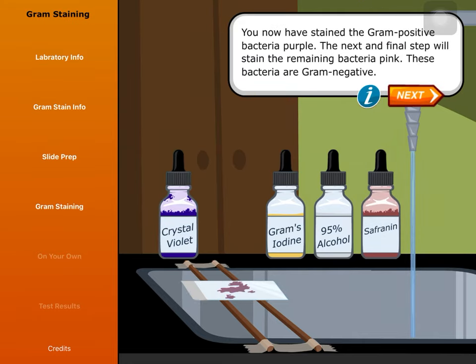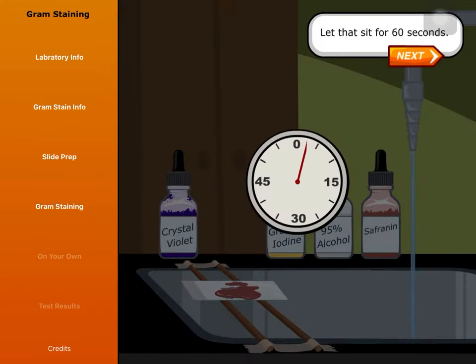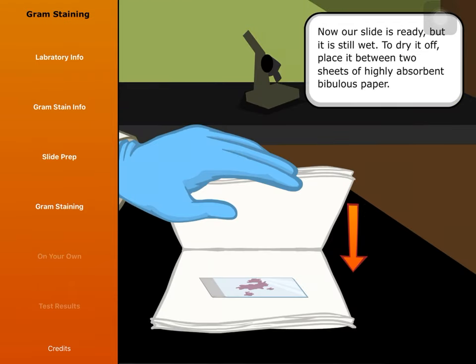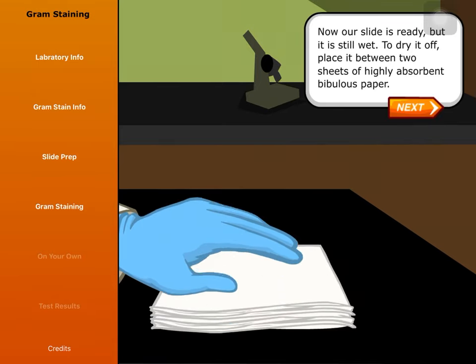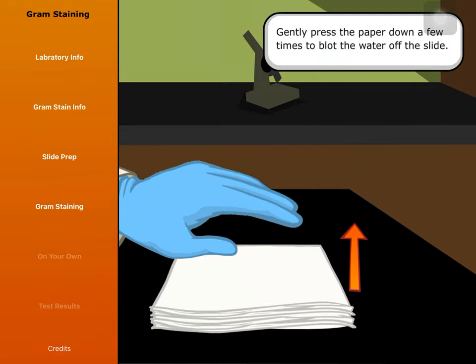You have now stained the gram-positive bacteria purple. The next and final step will stain the remaining bacteria pink — these bacteria are gram-negative. Use the dropper to cover the slide with safranin. Let that sit for 60 seconds, then rinse it under slow running water. Now our slide is ready, but it is still wet. To dry it off, place it between two sheets of highly absorbent bibulous paper and gently press the paper down a few times to blot the water off the slide.